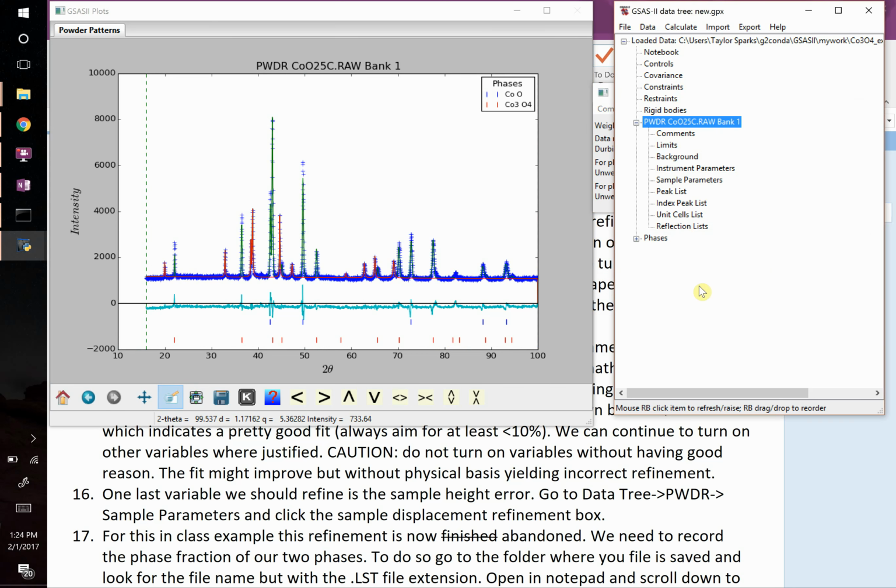I think I'll wrap up just about here, Jeff. We're almost done. So any of these steps that I've gone quickly over, it's all here. It talks about it in full detail here. You should be able to find it in these steps.